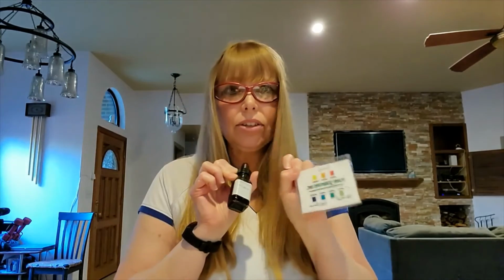All right, and the last thing we're gonna do here is, after we say, I think this is this and this, we're gonna write down all of our notes. You're gonna do it along with me in Pear Deck. And then we're gonna test to see if we're right by using some pH paper, which will tell us the pH, and also a universal indicator, which will change color and we match it up with the chart to see what pH it is. And then last, we'll use our good old red and blue litmus to see if it's an acid or a base. So let's go ahead and start.